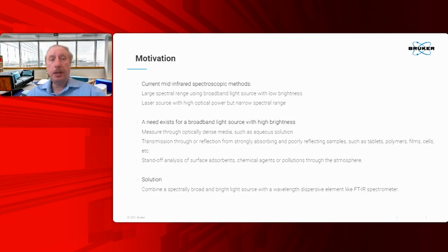Another application is the study of diffuse reflection light, which is reflected from poorly reflecting samples, for example tablets, polymers, and black carbons, like cathodes and anodes in batteries.